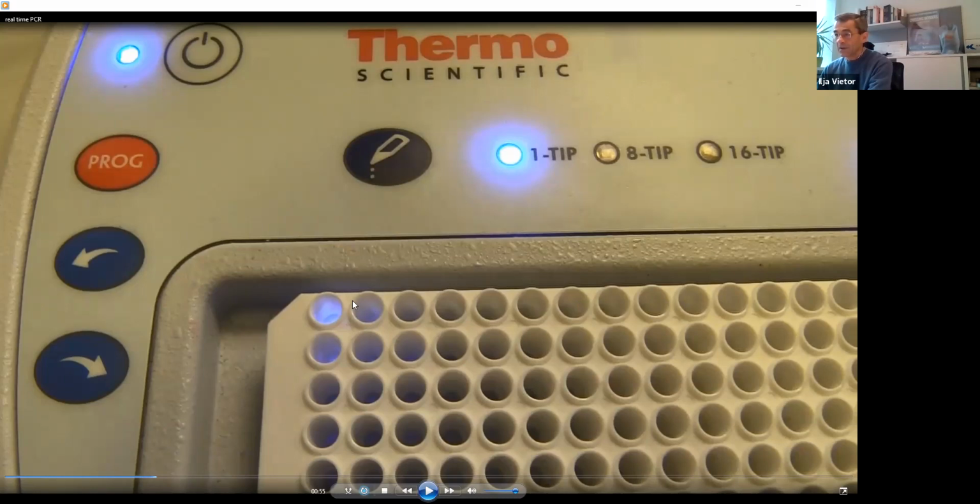So we go one by one, and first you have to fill in the master mix everywhere, and the second step is to add your samples. What I did was 3 times wild type, 3 times T7 knockout. The first row was for DLK1, and then once again 3 times wild type, 3 times knockout, and the second row was for GAPDH.